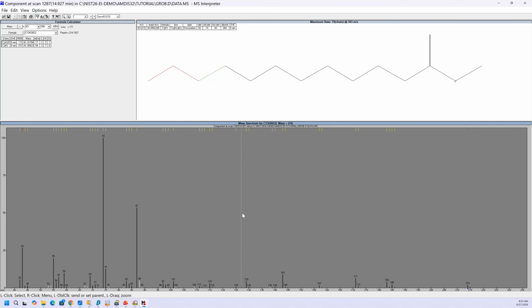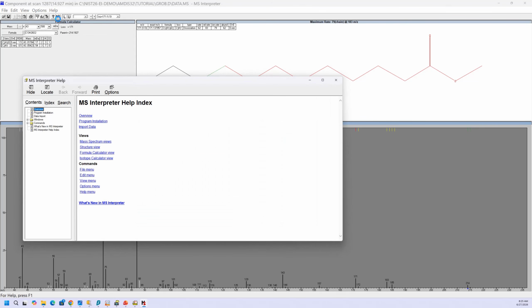You can expand it just like any spectrum that you want to. Double left click to make it go back. So pretty much the standard interface. It has some help built in. It doesn't say much about it in the manual, but if you go to help, index, there's some information there about it. That's very good.